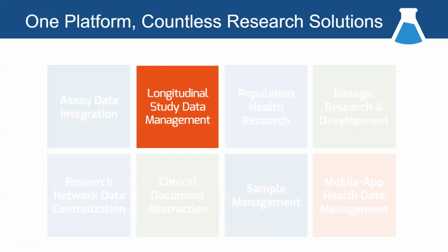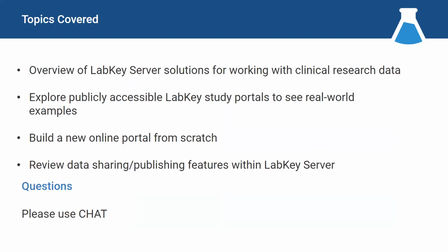Firstly, by way of an agenda, an overview of what we mean by research study data for LabKey, before looking at some real-world examples. Steve will also then build in real time a portal from scratch. And then we'll end with looking at some of the tools that are available in LabKey Server to allow users to publish and share research data.